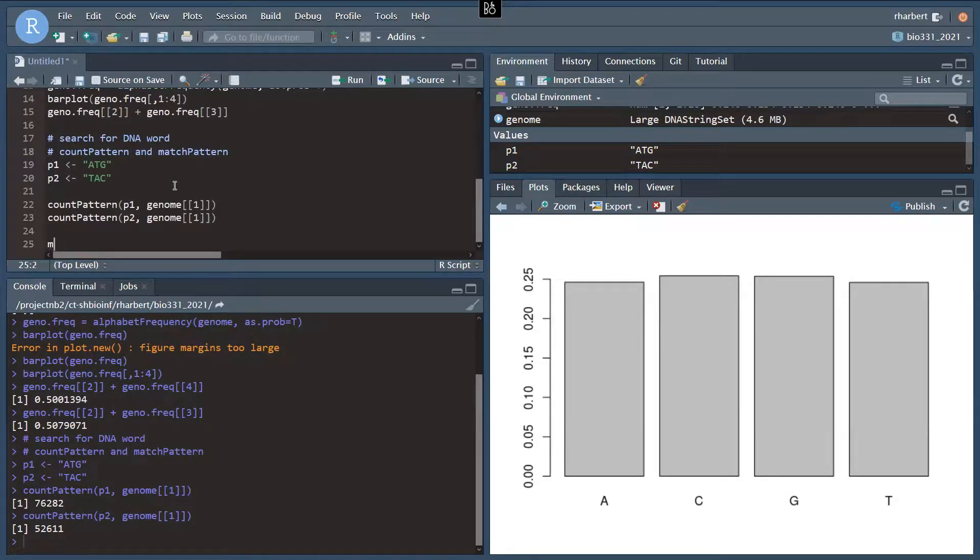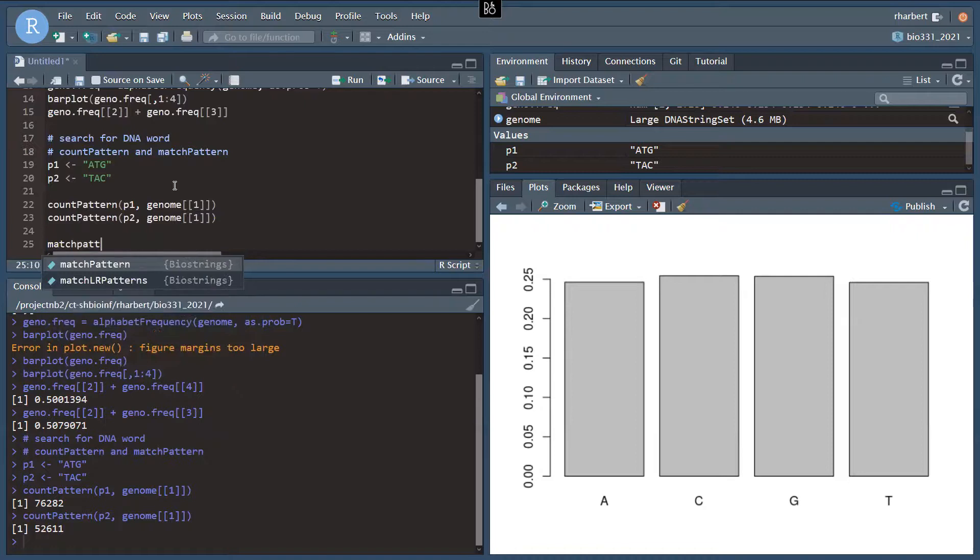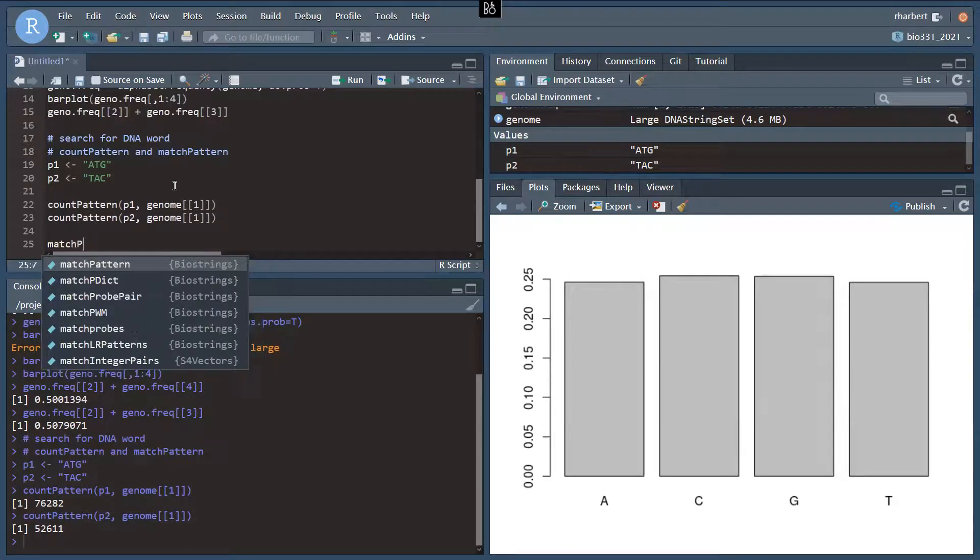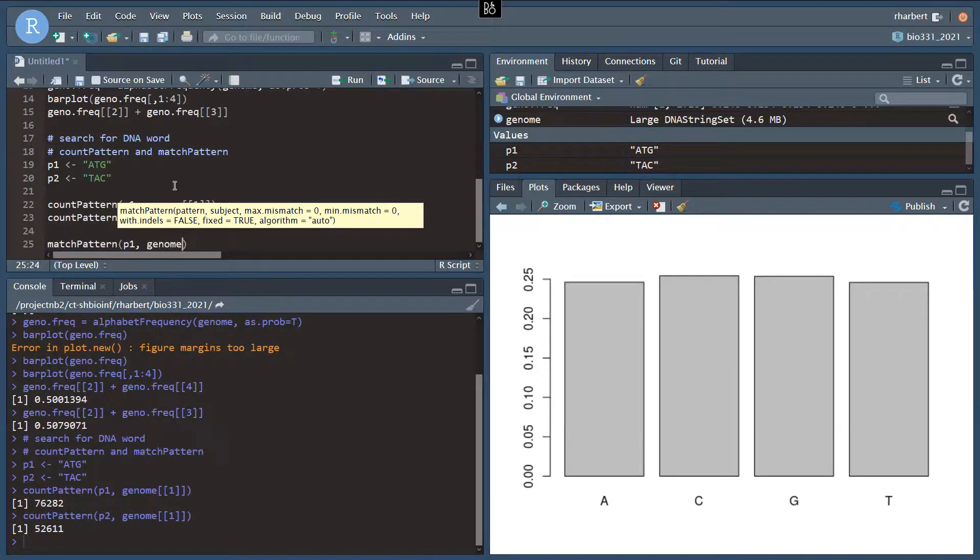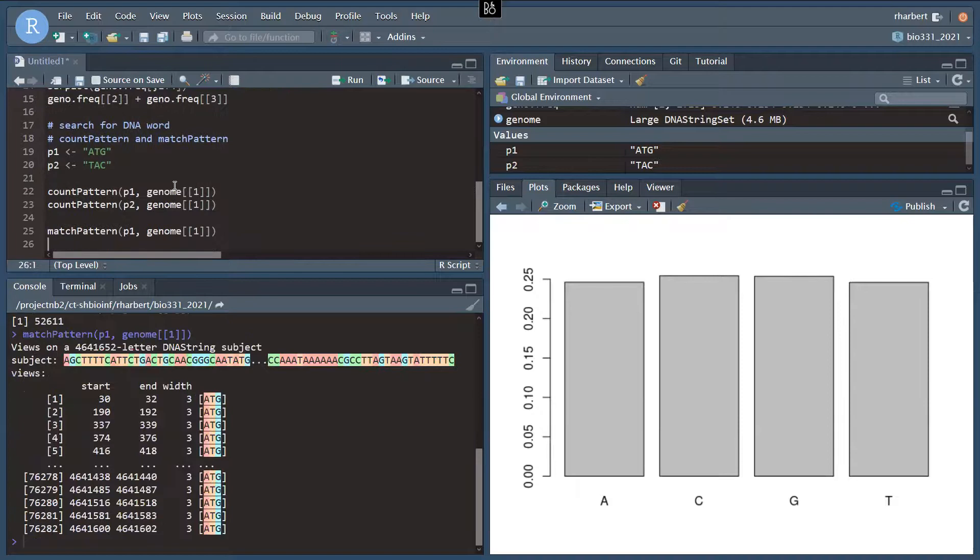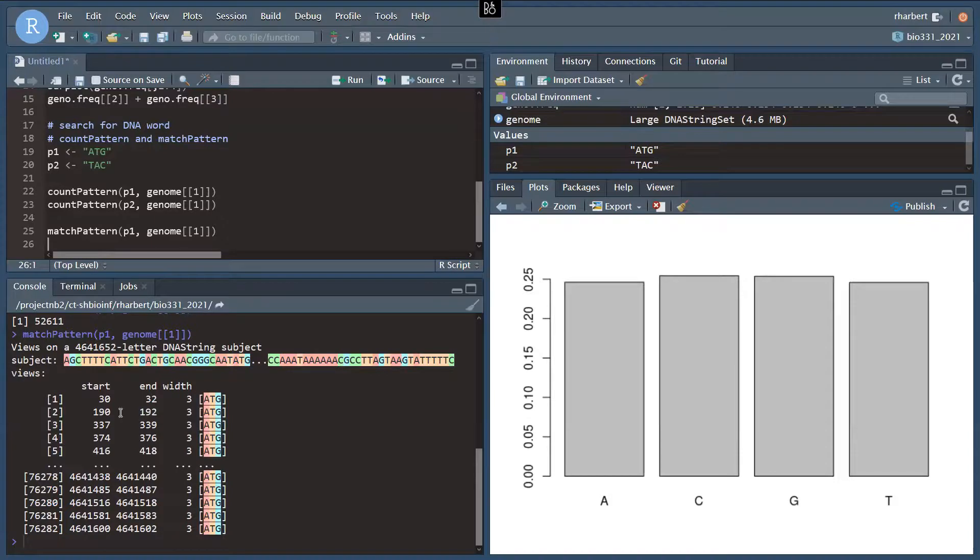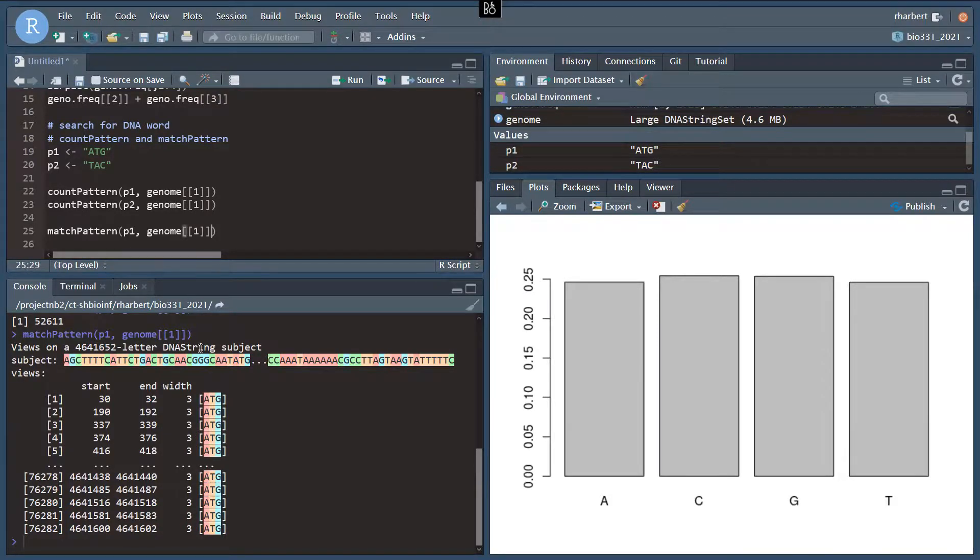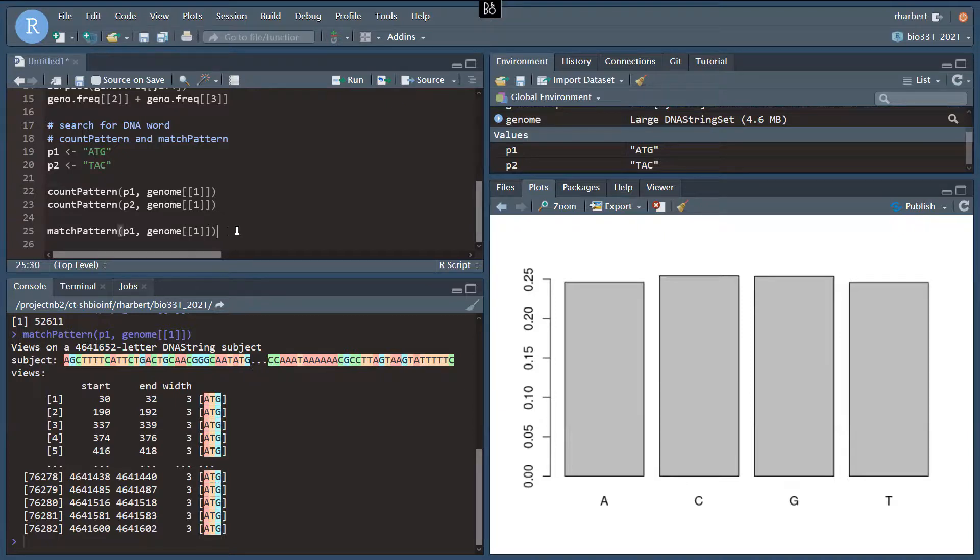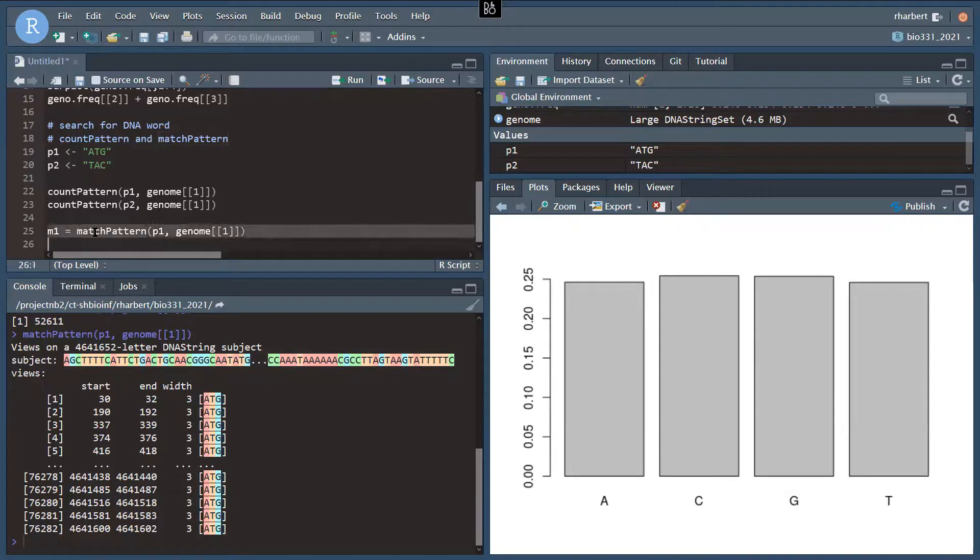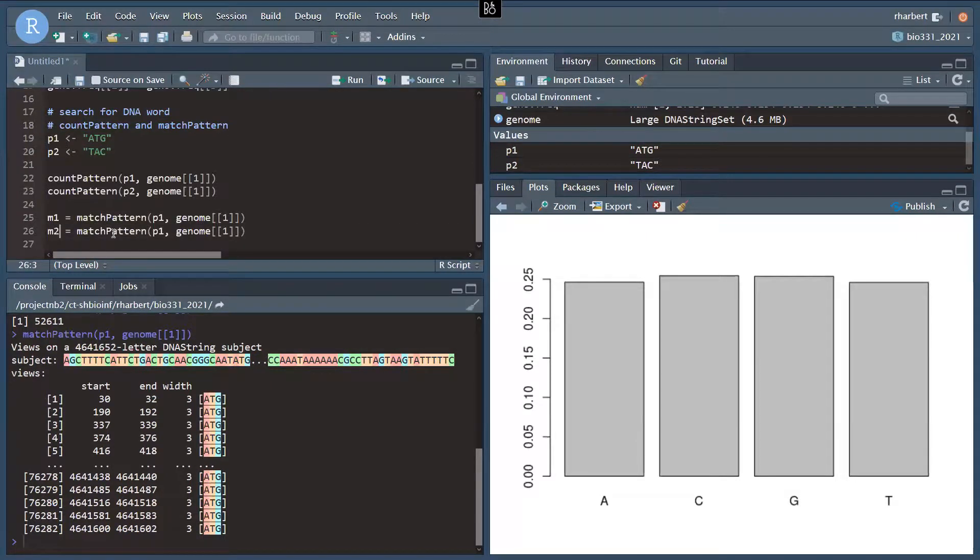The second function is matchPattern. This is going to return the data in a slightly different format, but we call it the exact same way. So matchPattern, P1, genome, and that's going to give us a table with the start and end of each match. The width is always going to be the same here. We can give it a number of mismatches allowed here as well, and then the width might be different if we get a partial match. And it gives us all 76,000 matches here, where they start, where they end, and what the match is. So let's call this M1, and we'll do the same thing for matches 2 with our second string.